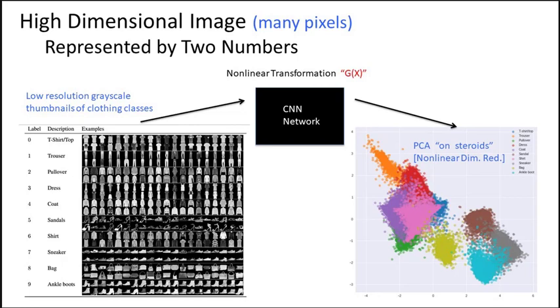The difference between a top and a pullover is a little fuzzy to me. But with this neural network, if you give labels, and instead of trying to get a class probability you try to compress these grayscale images, which are 32 by 32 in this case, so about 900 pixels, down to a 2-dimensional number, you start to see all the different fashion accessories form clusters or embeddings, where all the accessories from one particular class are clumped together.